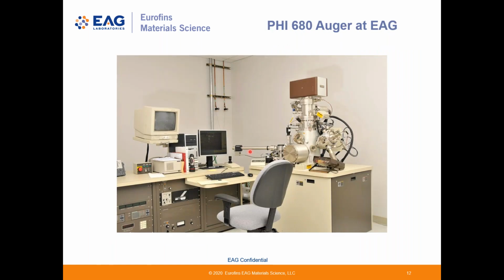So here's one of our Auger instruments. I wanted to show you what one looks like. I can point out some of the features of this marvel of engineering. At the top, there's a brown box-looking contraption. This is actually an ion pump that's dedicated solely to maintaining UHV conditions around the source. Our primary beam is a field emitter, and these emitters are very sensitive to surface contamination, so it's imperative that it stays clean for the entire lifetime of the tip.